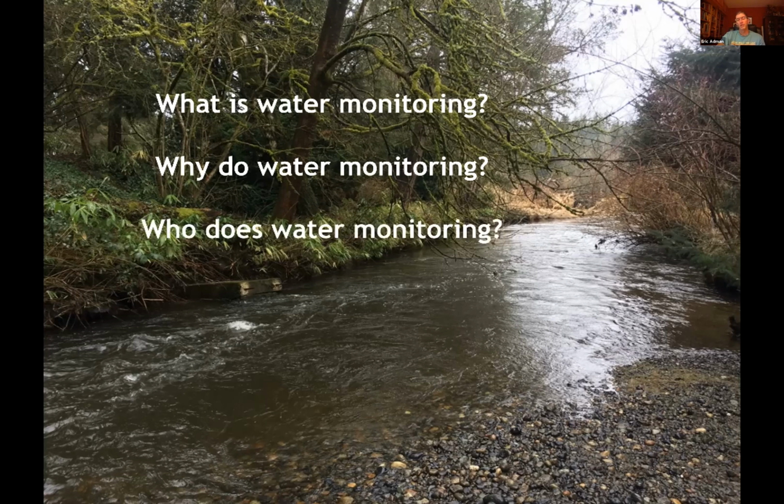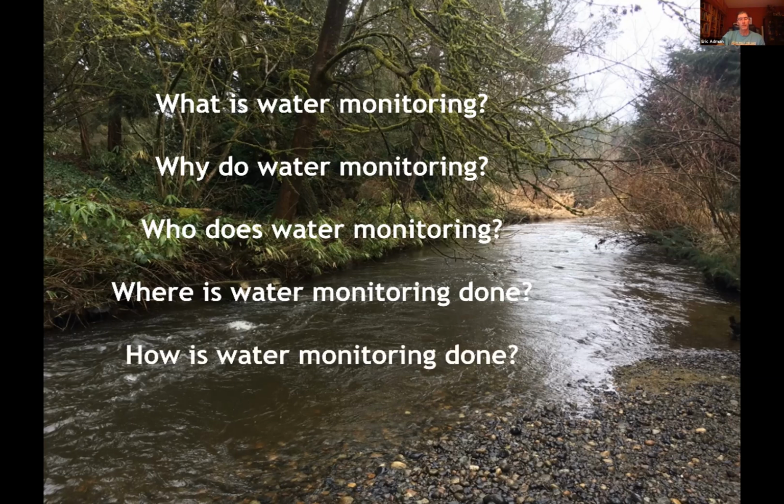It's done by volunteers and it's done by professionals. It's done by academics. It's done by a variety of different people for different reasons. It's typically done at a site that you've selected using specific criteria to make sure that that site is giving you some useful information. And we're going to get into the how of bacteriological water monitoring this evening.